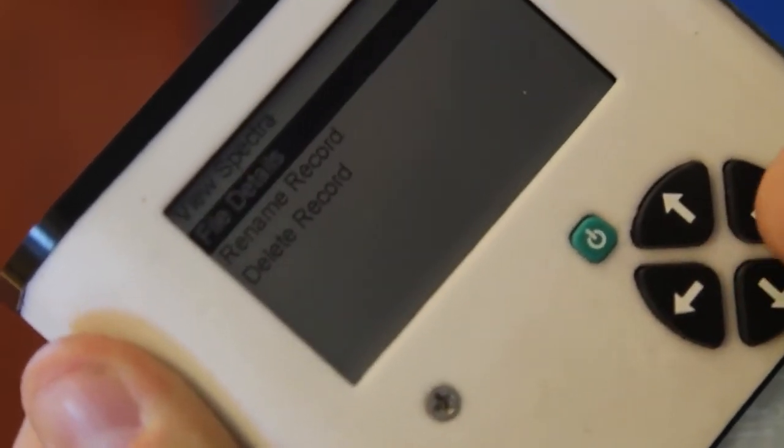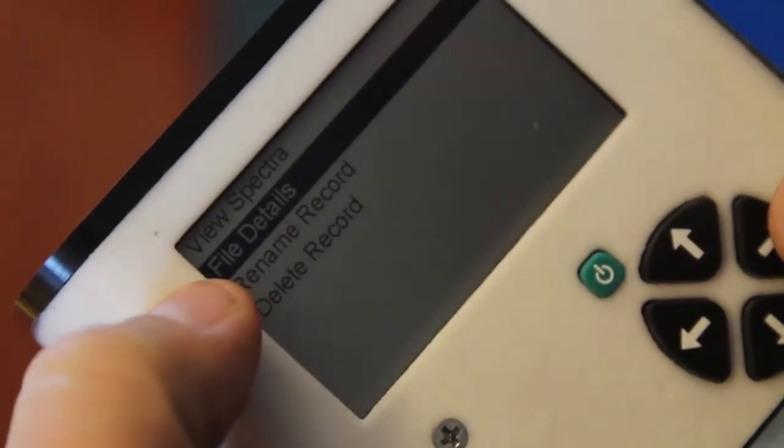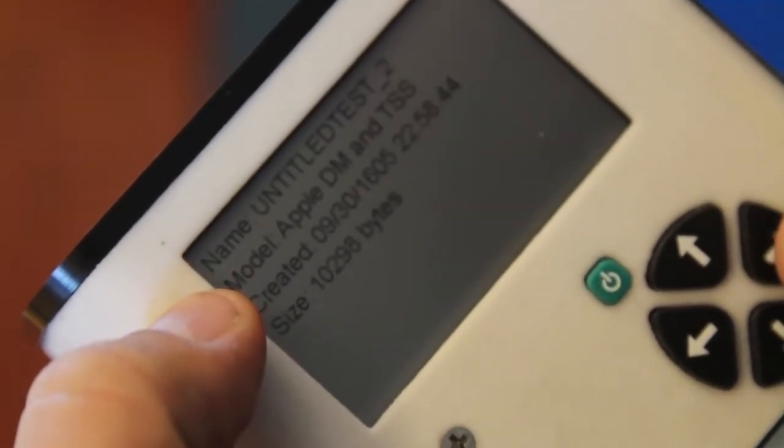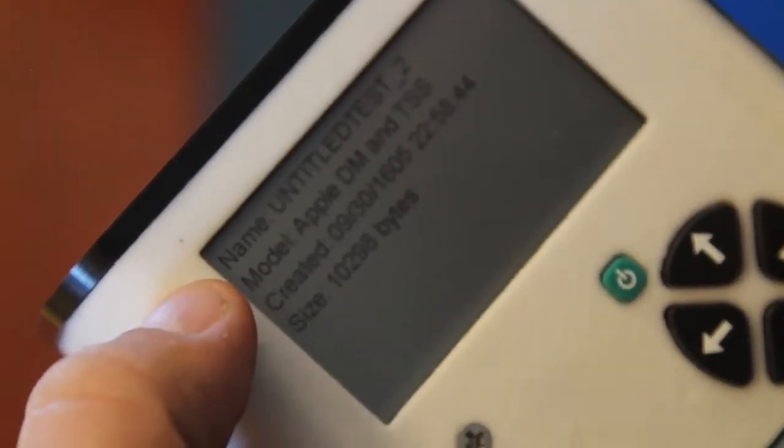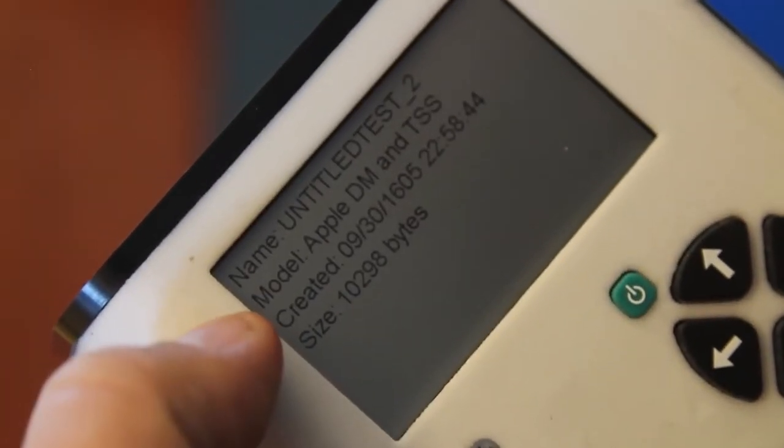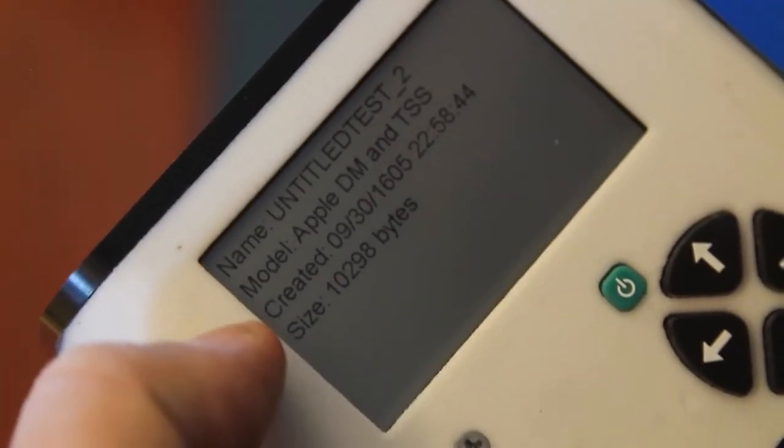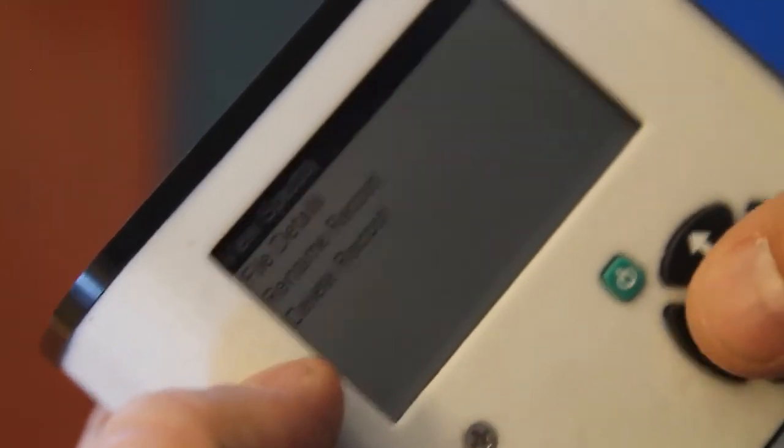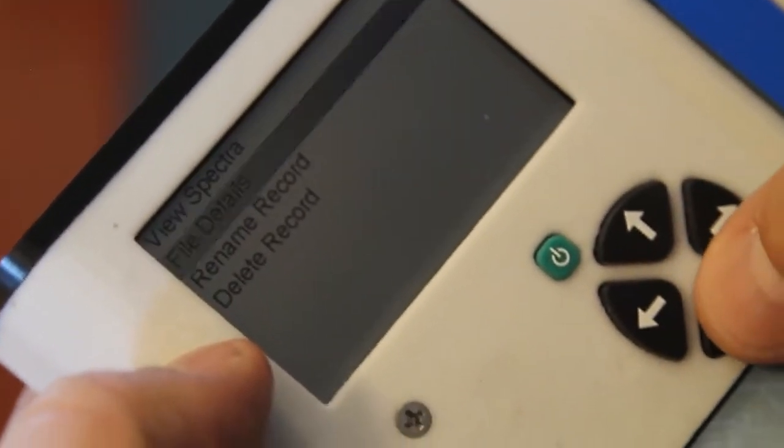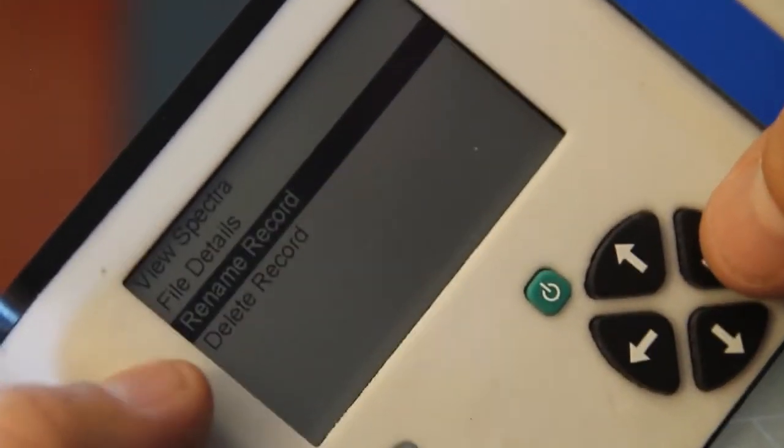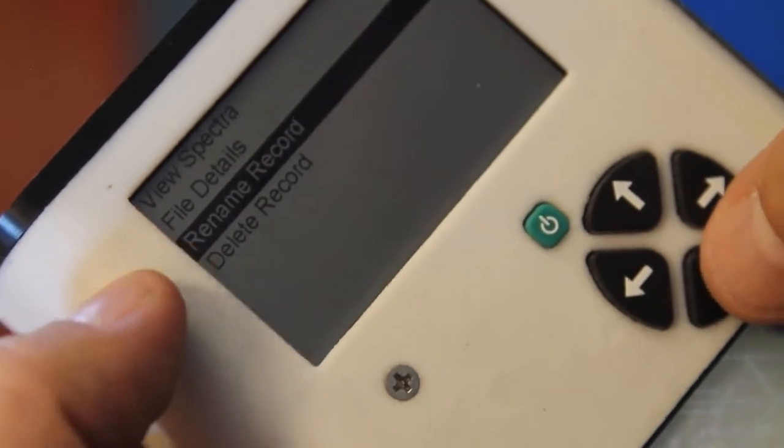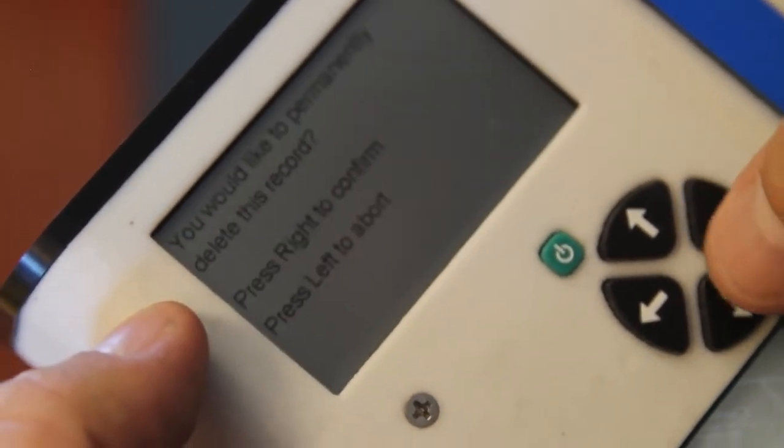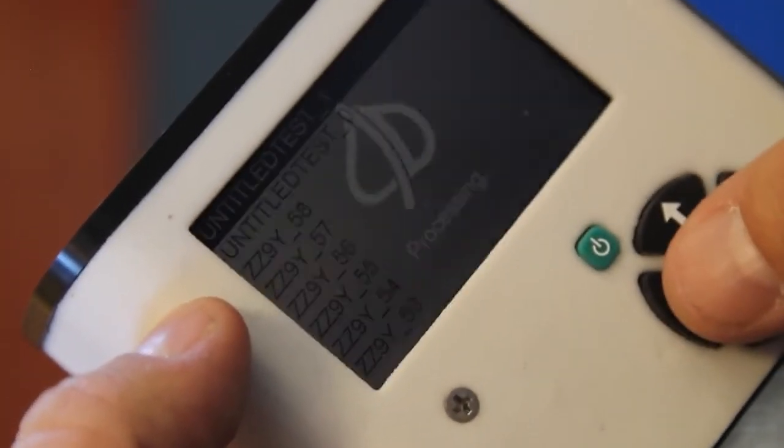We also have the ability to view the file details: the name, what model was used, when it was saved, and how large it is. In addition, we have the ability to rename files or delete them.